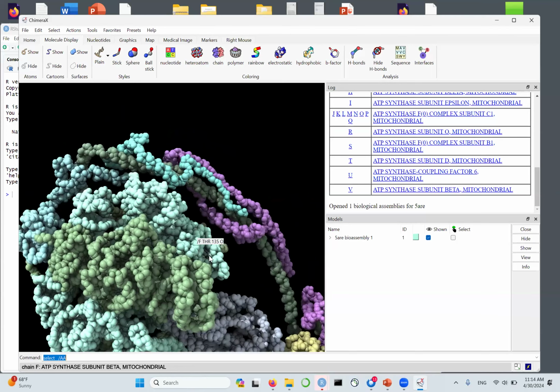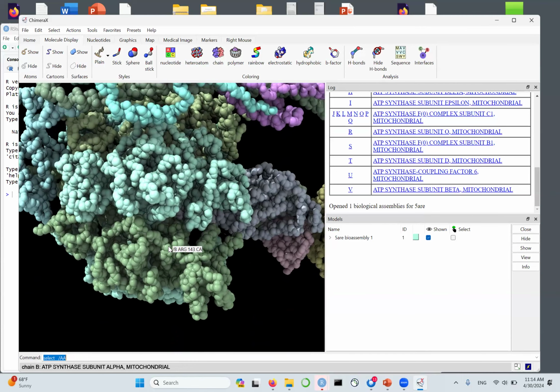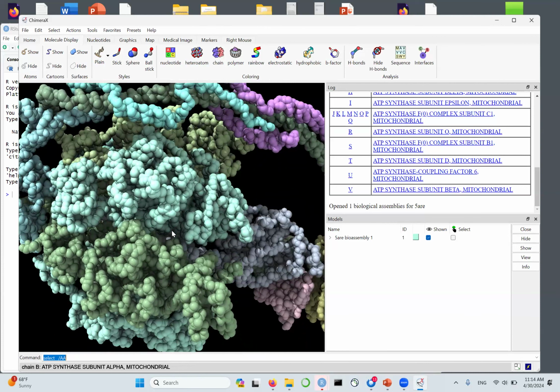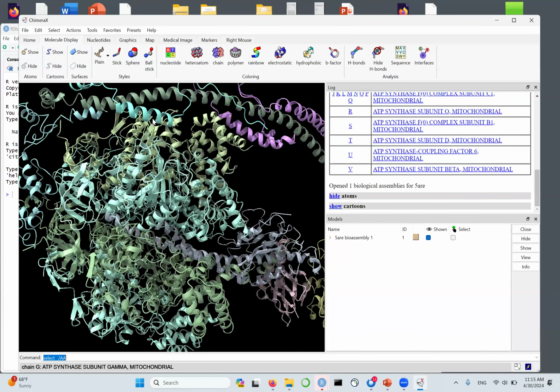And this is a rendering that shows you the actual size of the atoms, so you can get an idea how packed those things are. But we can always revert to, we can turn off the side chains, so we can hide the side chains, go back to showing cartoon representation, and here's the protein. It seems to be colored by chain, or by chain type, but we can always change the coloring if we wish. We can color it by chain, whatever Chimera thinks it should be.